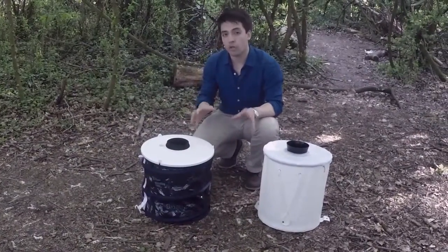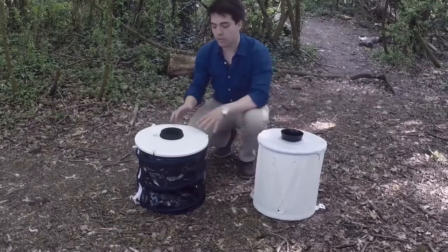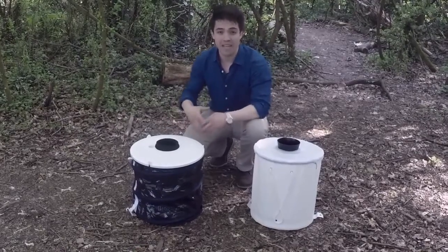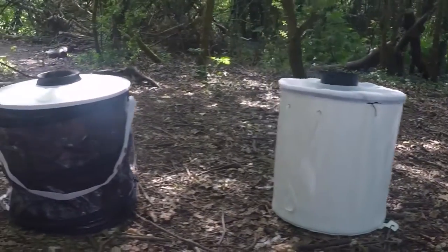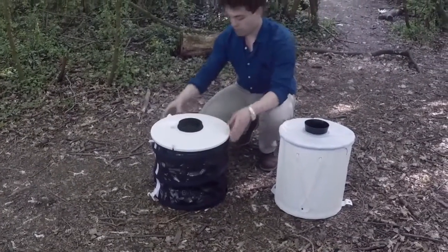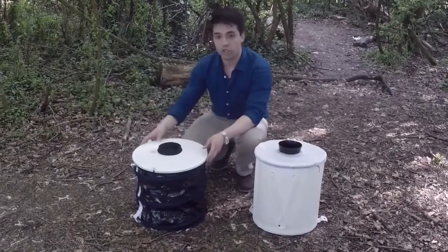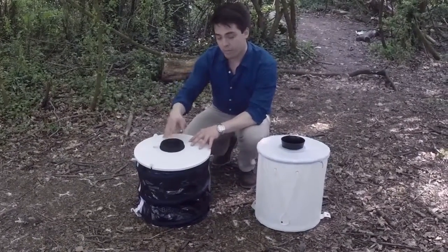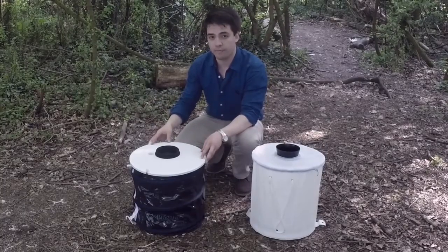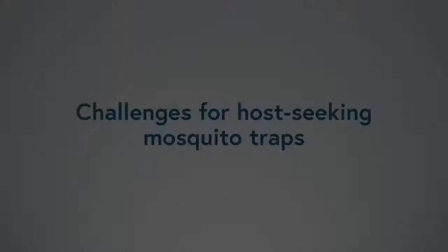I have in front of me two of the most commonly used traps for Aedes host-seeking adult mosquitoes. These are the BG Sentinels — this is the original version, and this is the more recently released updated version, the BG Sentinel-2. These traps work on the basis of creating a convection current, mimicking the natural processes that release odors from a host. Here at the top of the trap, we have a fan inside into which air is drawn. A chemical blend derived from human skin odors, such as lactic acid, is added to the trap as a package or cartridge placed inside the trap. Air drawn into the trap subsequently leaves through the outer edges, taking with it the chemical blend and creating an odor plume which can be detected by the mosquitoes. Closer in, the mosquitoes are additionally attracted by the alternating dark and white colors of the trap.